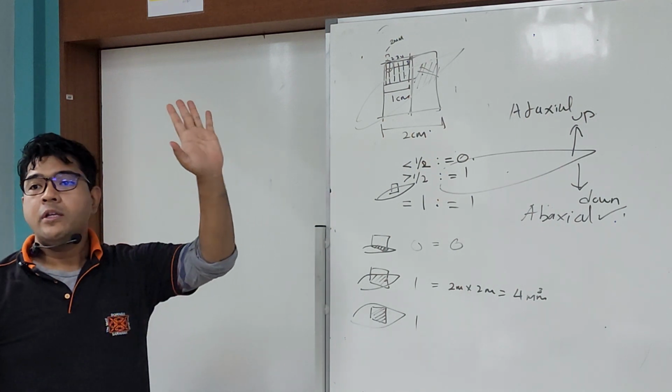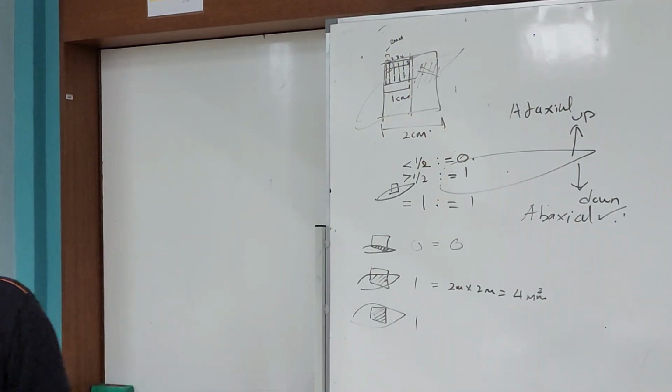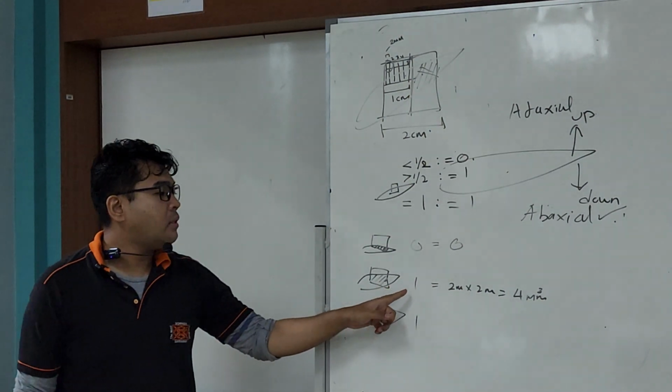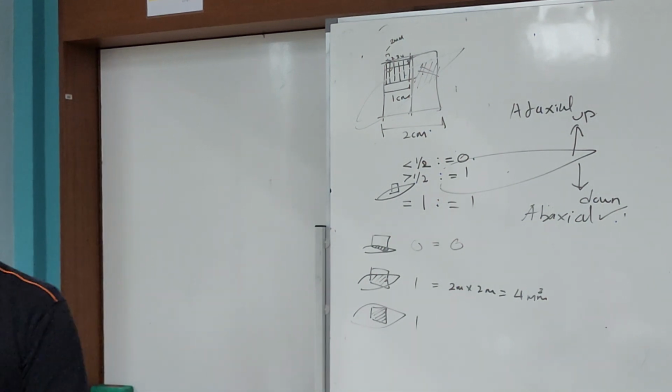Later on, you can quantify easier because you just count the number of ticks. I know it could be harder to see with a carbon pencil, but you can use the pen to tick the squares that have achieved either this or this. Tick first, count later.